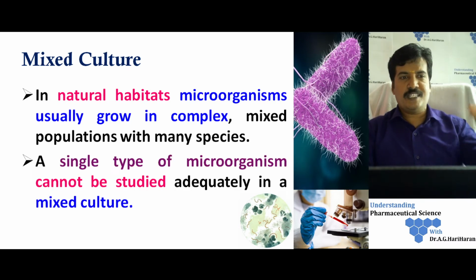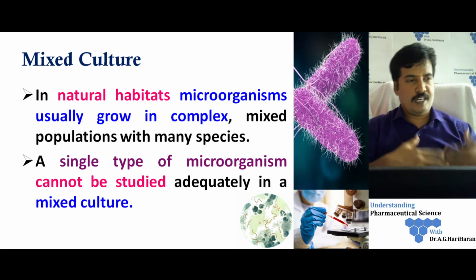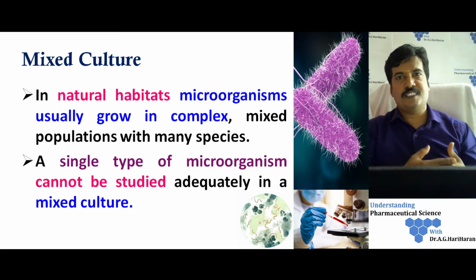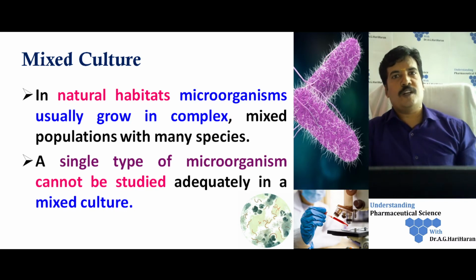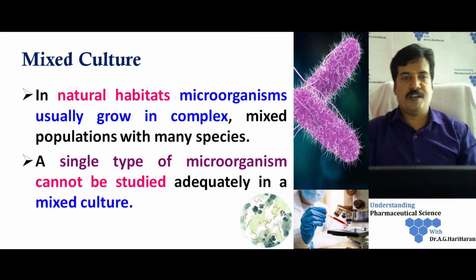In a mixed culture it is very difficult to study a particular type of microorganism. So if you want to study a particular microorganism, the first step is to isolate a pure culture of this microorganism from this mixed environment. That becomes the first stage.